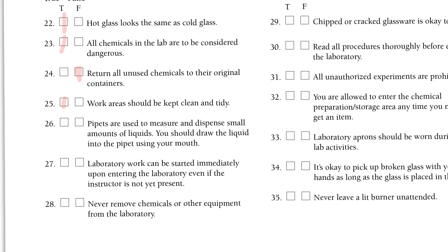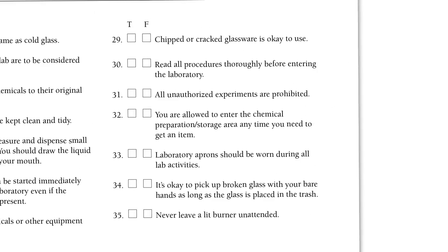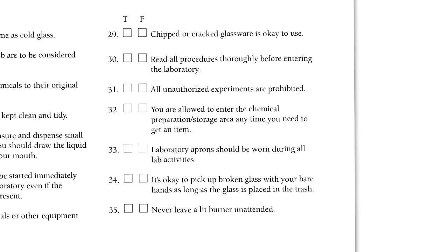Pipettes are used to measure and dispense small amounts of liquids. You should draw the liquid into the pipette using your mouth. Yes! That sounds like the best. Laboratory work can be started immediately upon entering the lab, even if the instructor is not yet present. False. Right, you gotta make sure I'm in the room. Never remove chemicals or other equipment from the lab. You gotta be careful with the nevers, with those true and false. They get people all the time.